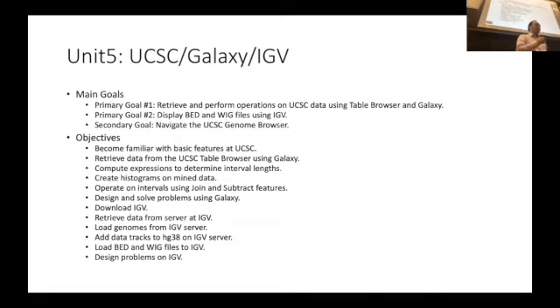So major difference. Do you remember you guys already used the genome browser from NCBI, NIH? For that, you have to be connected to the internet all the time, basically. But if you install this genome browser locally to your own computer, like IGV, you don't have to be connected to the internet. You can use that. So it's the genome browser, and another very helpful genomic resource.